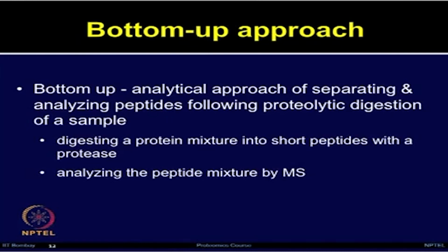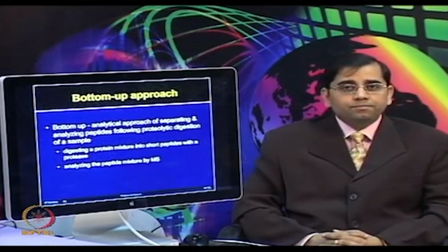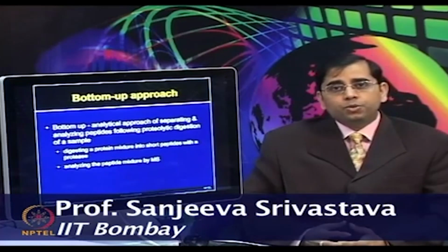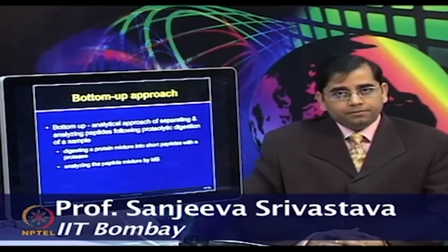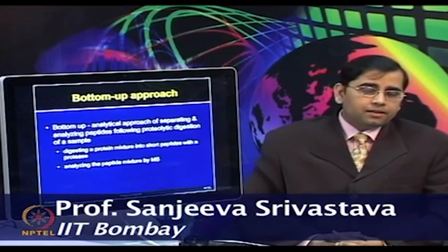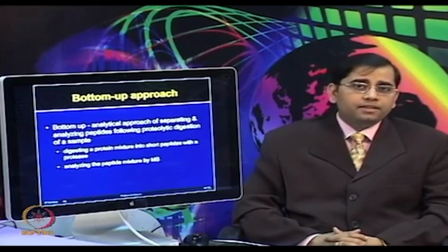First of all, proteins are digested by using trypsin or some other proteolytic enzymes. Peptides are separated by using liquid chromatography and introduced inside the mass spec. Peptides fragment inside the MS and proteins can be identified by using databases.